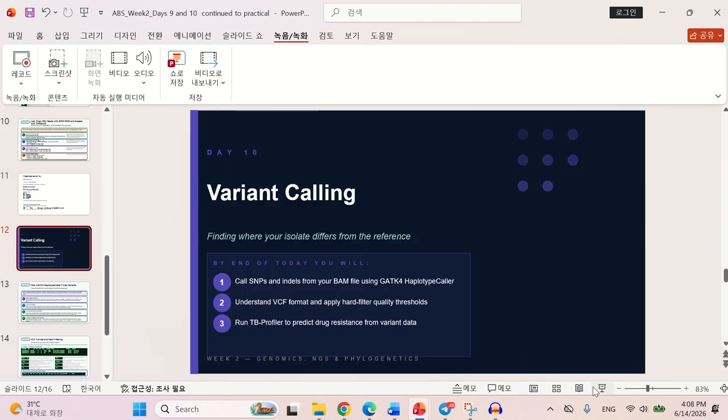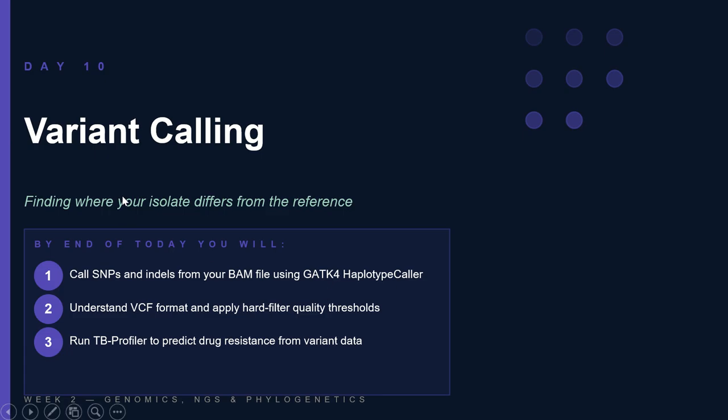Hello, everyone, and welcome to day 10. Today we'll be talking about variant calling. What do we mean by variant calling? You do a very deep search where you find where your isolate differs from the reference.